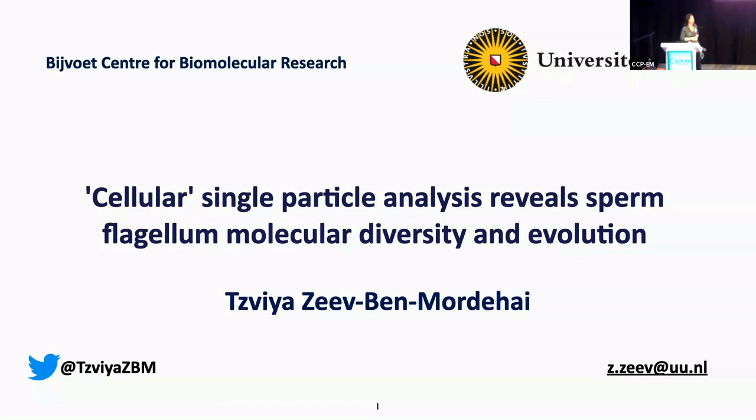I think we are in a way continuing the same theme, because I was also trained in tomography and did a lot of cryo-electron tomography, and faced a similar problem that Martin just mentioned: we see so many things, and this is why we like tomography, but very often we don't reach the resolution that we need. So we also had to be creative about how to identify some of the proteins that we see in our cell.